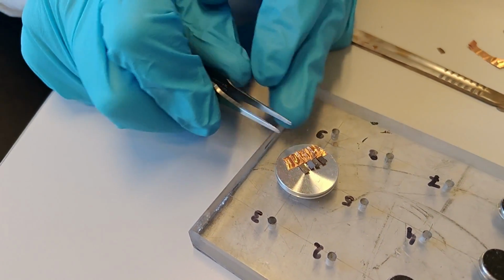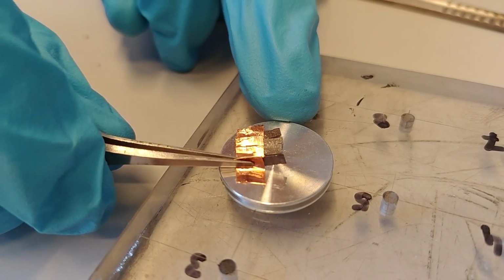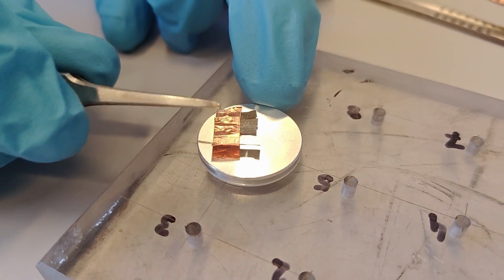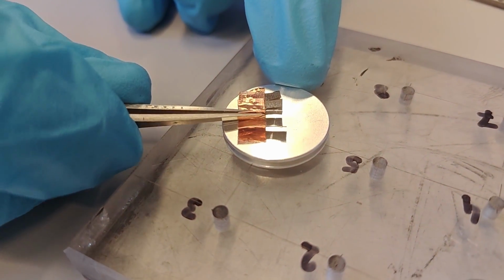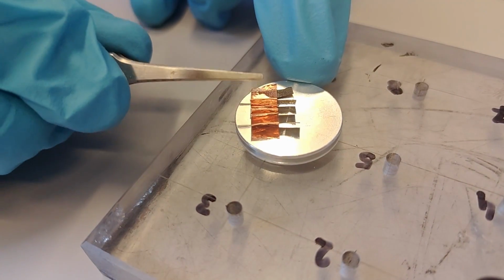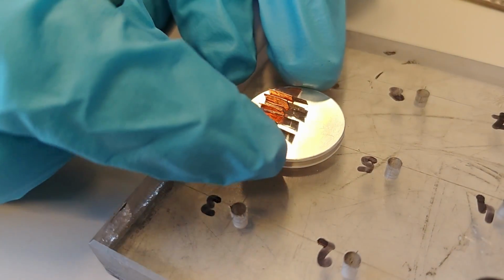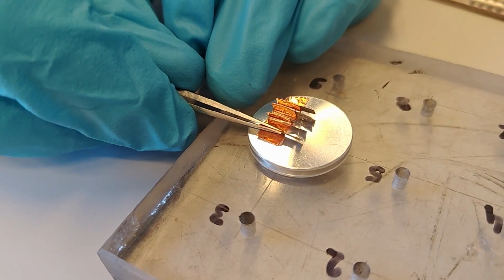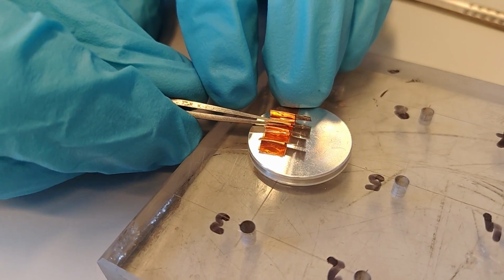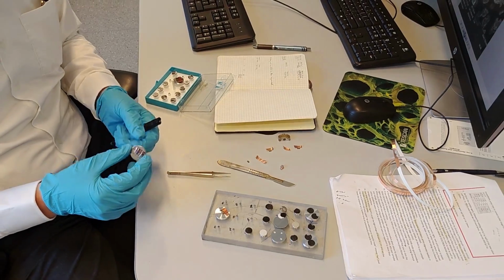So what we want to do now is take the tweezer and we flip these ones up, right? Now we want to flip them over, so we don't want them to be 90 degrees up in my case, because I have coated paper, so I'm going to sputter iridium on these now, on the back side, because the electrode itself is conducting. So that doesn't need any coating. It's the backside that's important. So then I make them like this, so they are at a 45-degree angle before I send them into the coater. So we can make a pause.